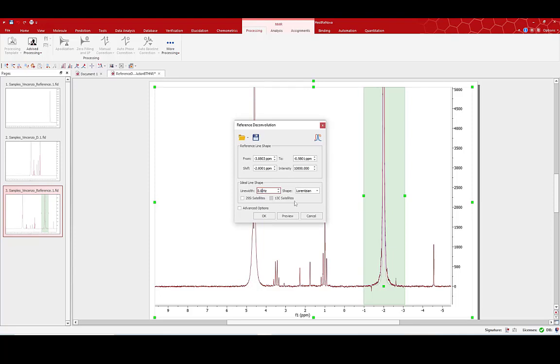I'll set 0.6 hertz and choose a Gaussian, because the Gaussian line shape is slightly narrower at the base. If my reference peak has silicon satellites such as TMS, or carbon satellites like chloroform TMS, you would need to select those options to model the satellites correctly. This is just a water peak — we can see there's a little bit of 50 hertz interference, but by including that 50 hertz option it will be corrected across the whole spectrum.